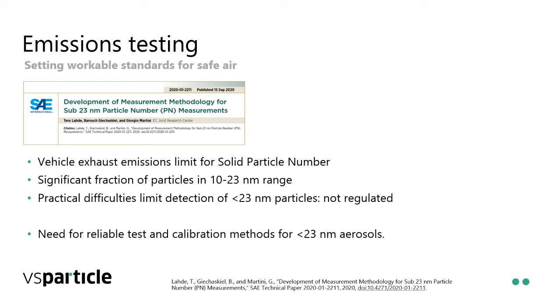On that side, both trying to develop these calibration methods, but if you want to make these calibration methods or these measurement methods, you also need to have a particle source that can make these 10 nanometer particles. So this chicken and egg problem we're trying to sort of help out with. So this is research performed at the Joint Research Center of the EU in Ispra, Italy.